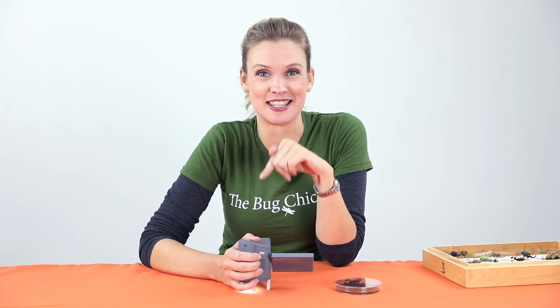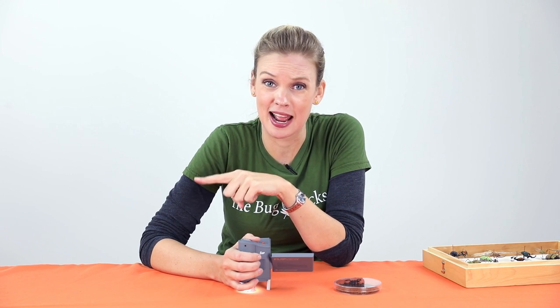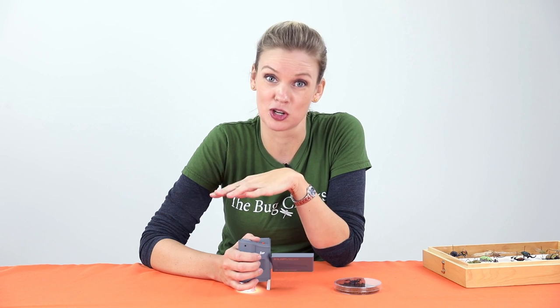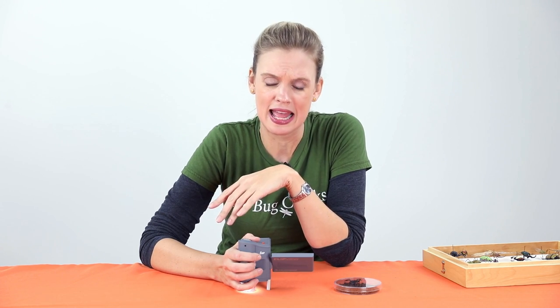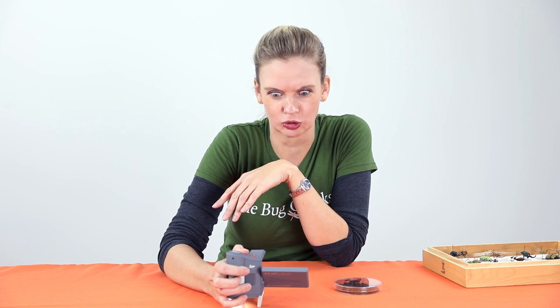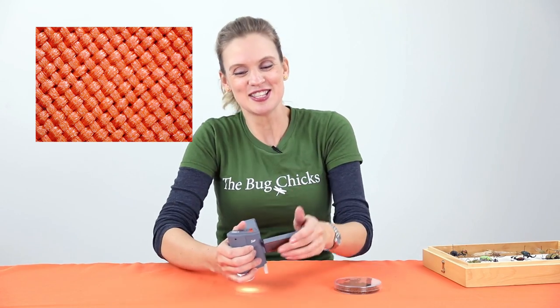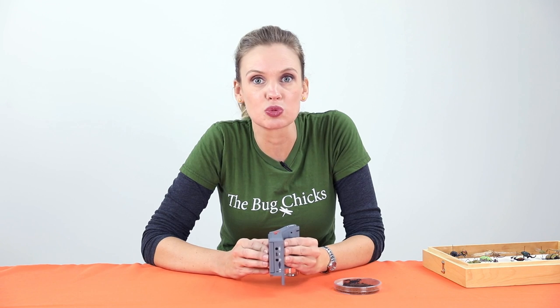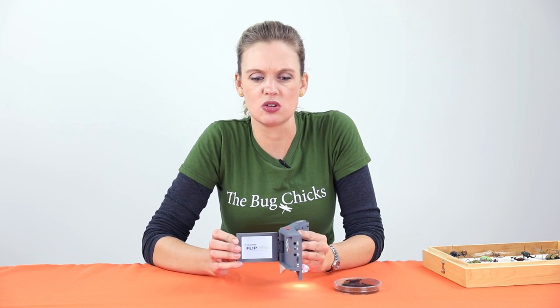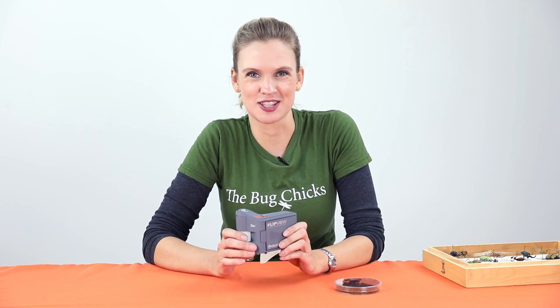I am addicted to this little scope. I carry one with me almost all the time — I've got one in my backpack right over there and I have one in my glove compartment in my car just in case I run into something cool. I'm so addicted that I'll put it down on a tablecloth and be like, ooh, what does a tablecloth look like close up? So if you are interested in getting something for someone, for a child, for a classroom that is so easy to use, so ergonomic, and is rugged and durable — I think this is your microscope. The FlipView by Celestron.